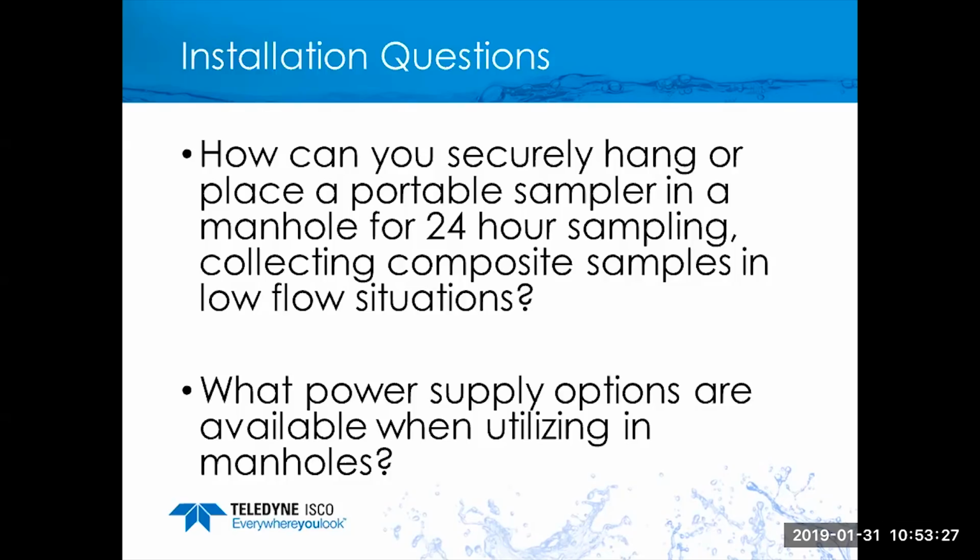The added weight there not only has to be accounted for with respect to the hardware, but the person that's going to lift that sampler also has to be taken into account. So we want to go to reasonable lengths to make it easy to remove that sampler from the location when our sampling collection is completed.